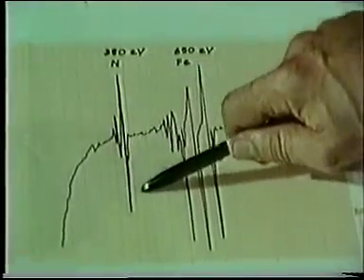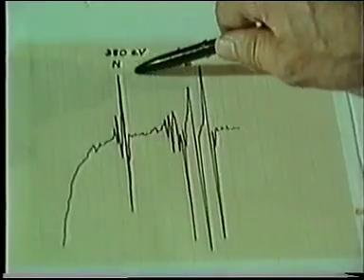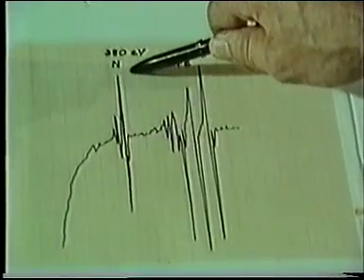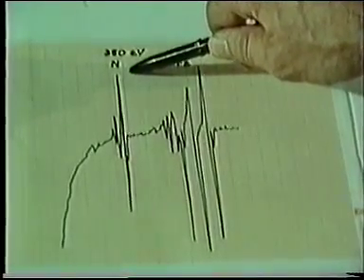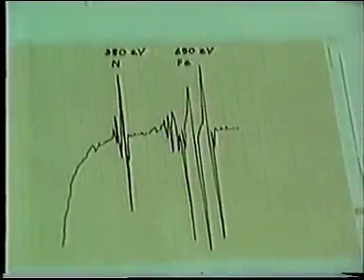You can see that these 2 peak heights are similar. So on this saturated surface, where the nitrogen-iron ratio is 1 to 2, the ratio of these 2 peak heights is close to 1. Now we can use this calibration of the Auger spectrometer to determine the surface concentration of monatomic nitrogen during ammonia synthesis.